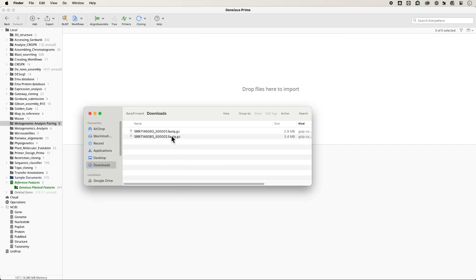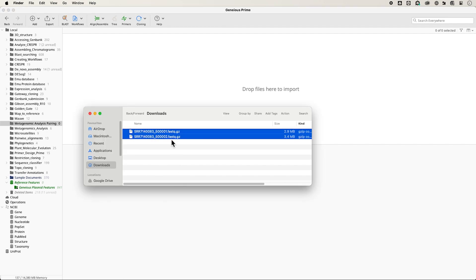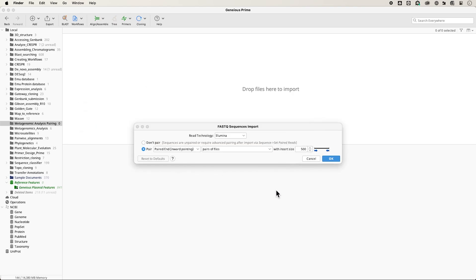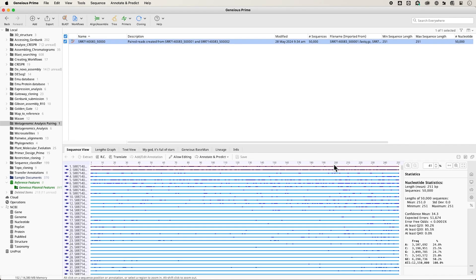Typically, paired Illumina reads are provided as separate forward and reverse read lists in FASTQ format. If you import these together, Genius will offer to pair the sequences and create a single paired read list on import.